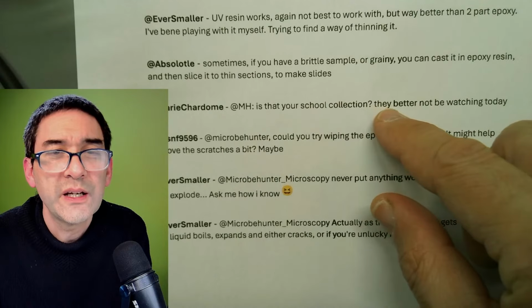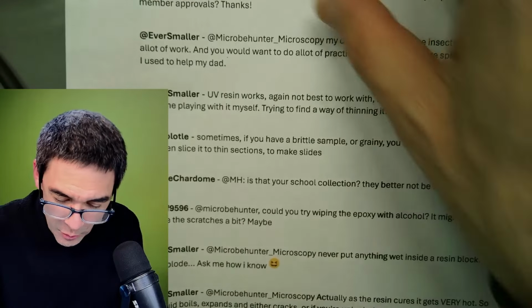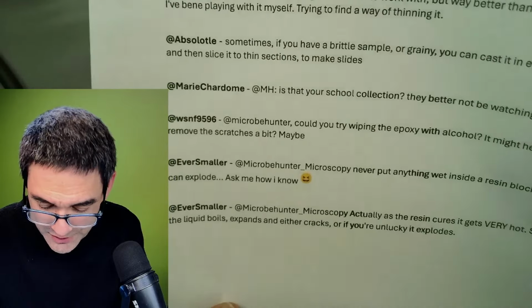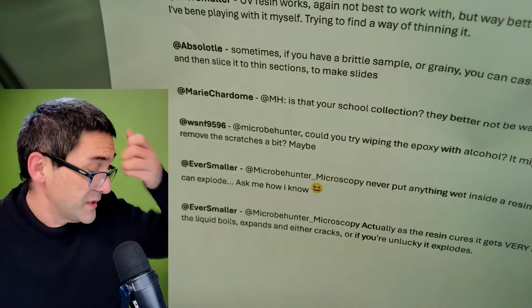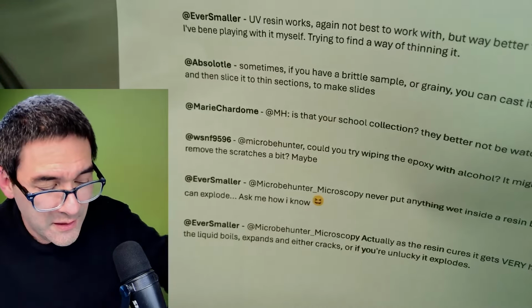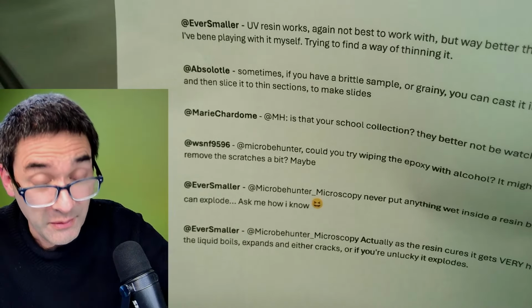Is that your school collection? They better not be watching today. Well, some of the students are watching, right? I hope at least. But the thing is the following, this whole watching today, this is probably because of this fungal poison.